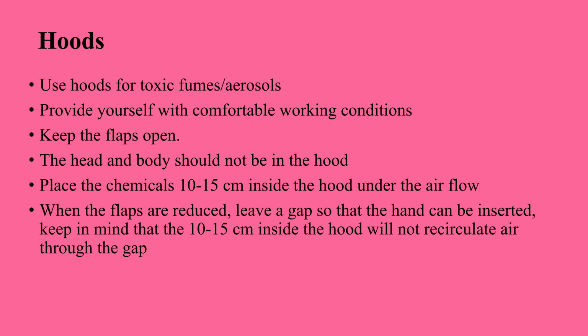Another important question is fume hoods, when you work with chemicals. In our histology lab, we also work in the hood in most cases when we work with aggressive chemicals.